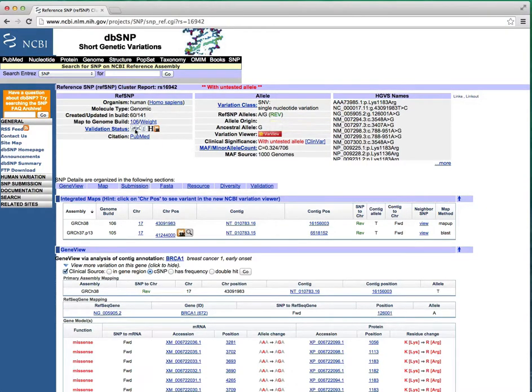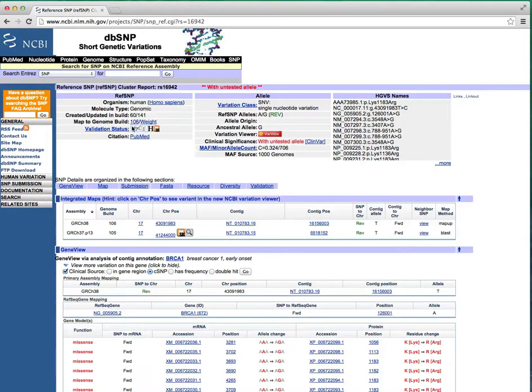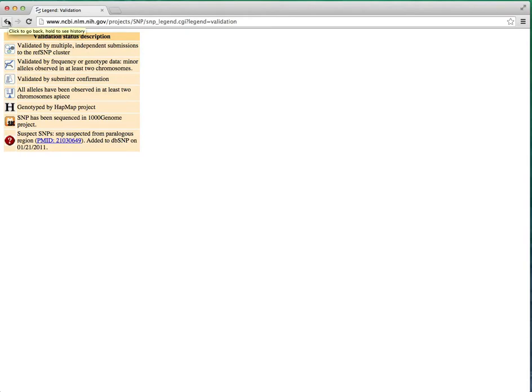Inspecting validation status gives you some confidence whether this is a real variant. The report shows that it has been found in HapMap and Thousand Genomes, as well as three other types of validation. If you click on the validation status link, it'll give you a legend that describes all the icons you may see in validation status.